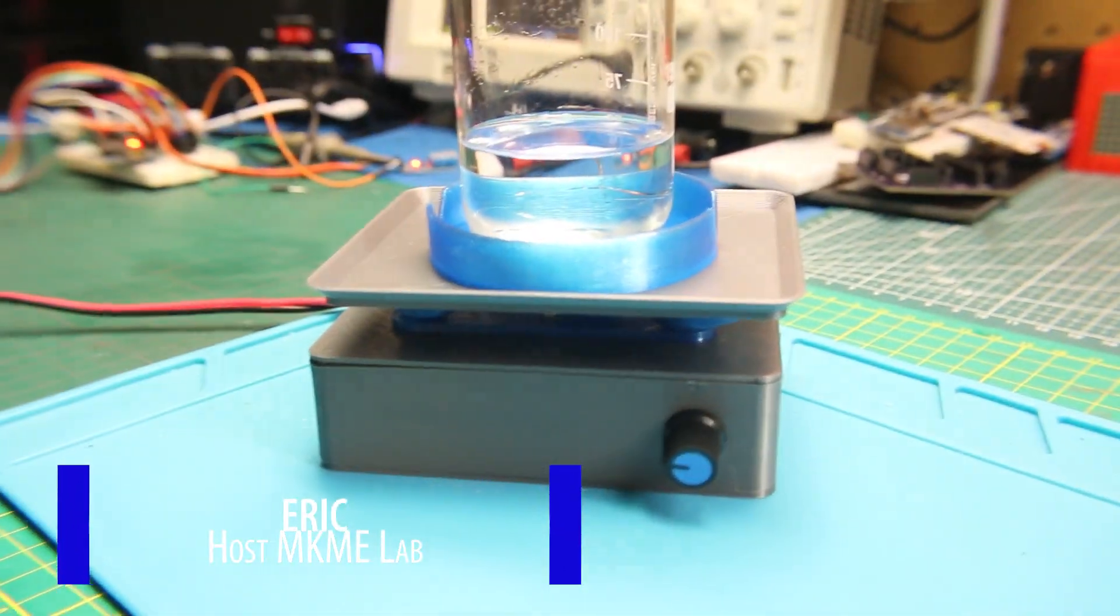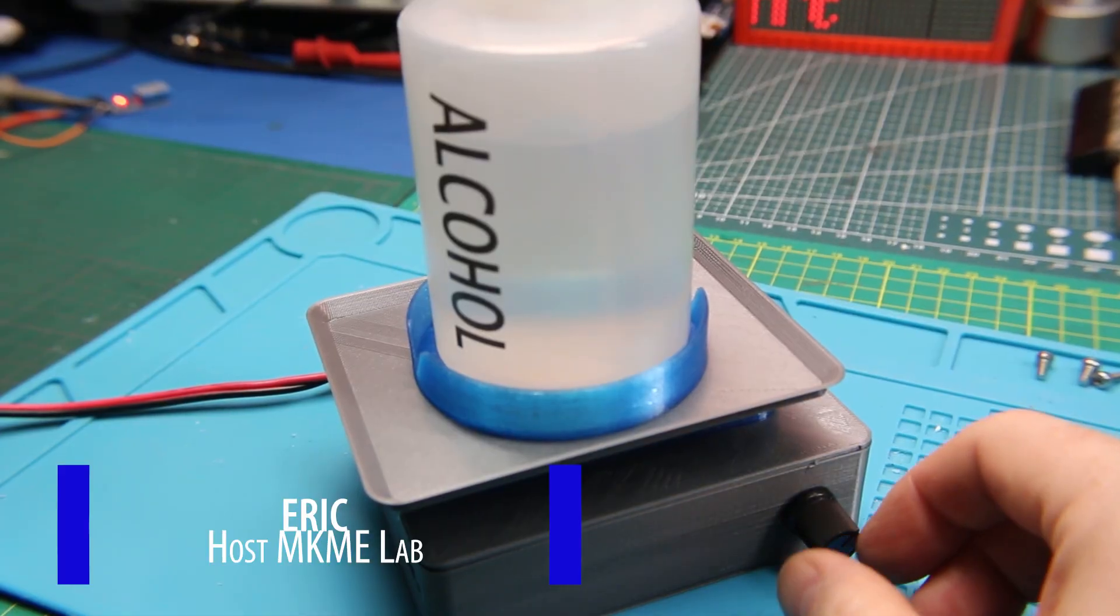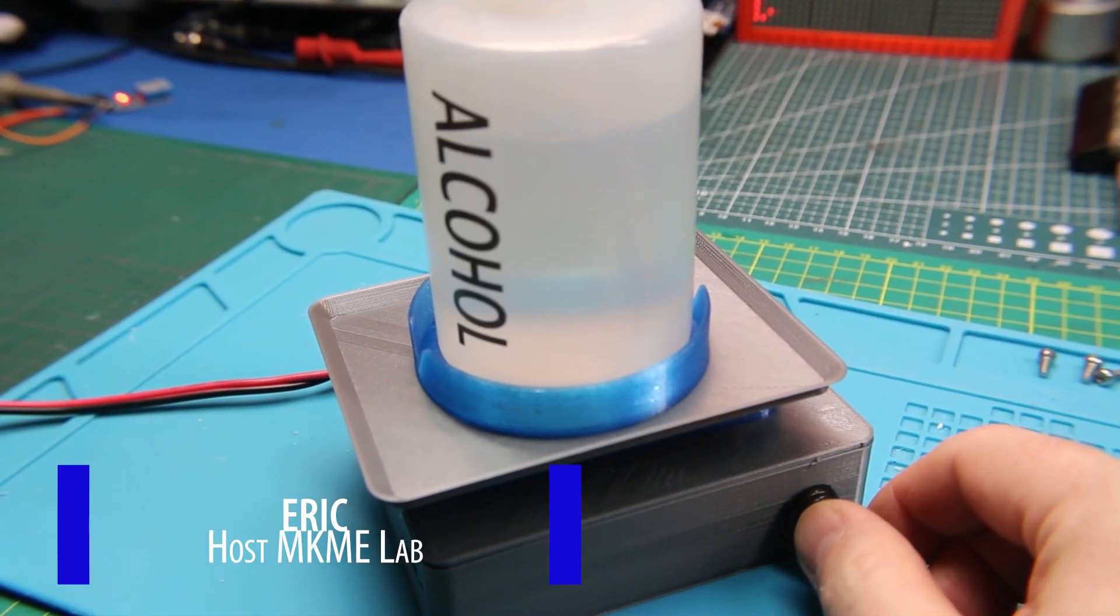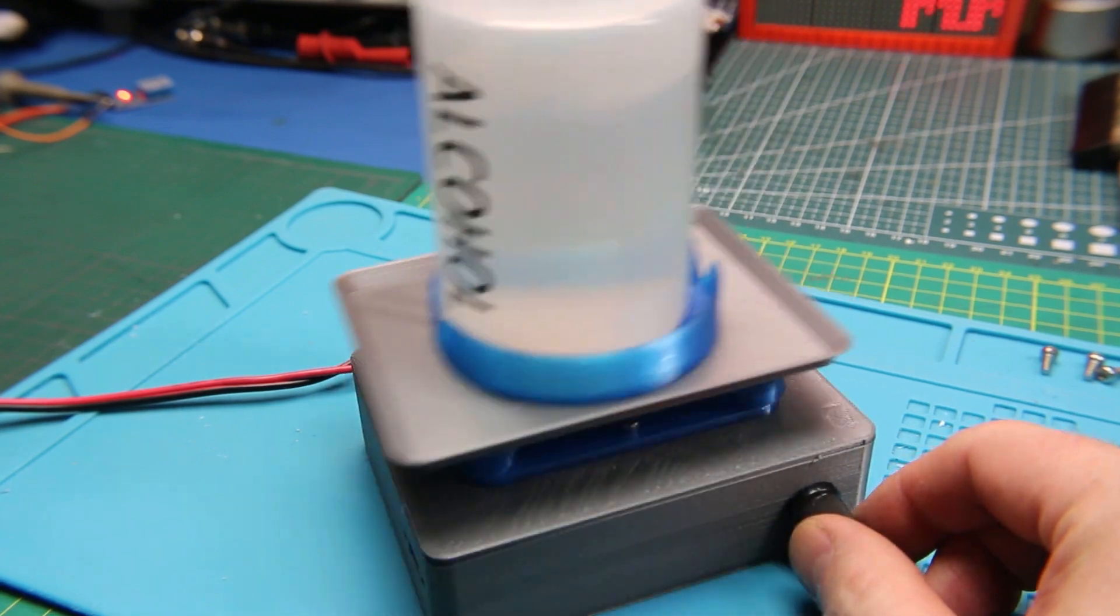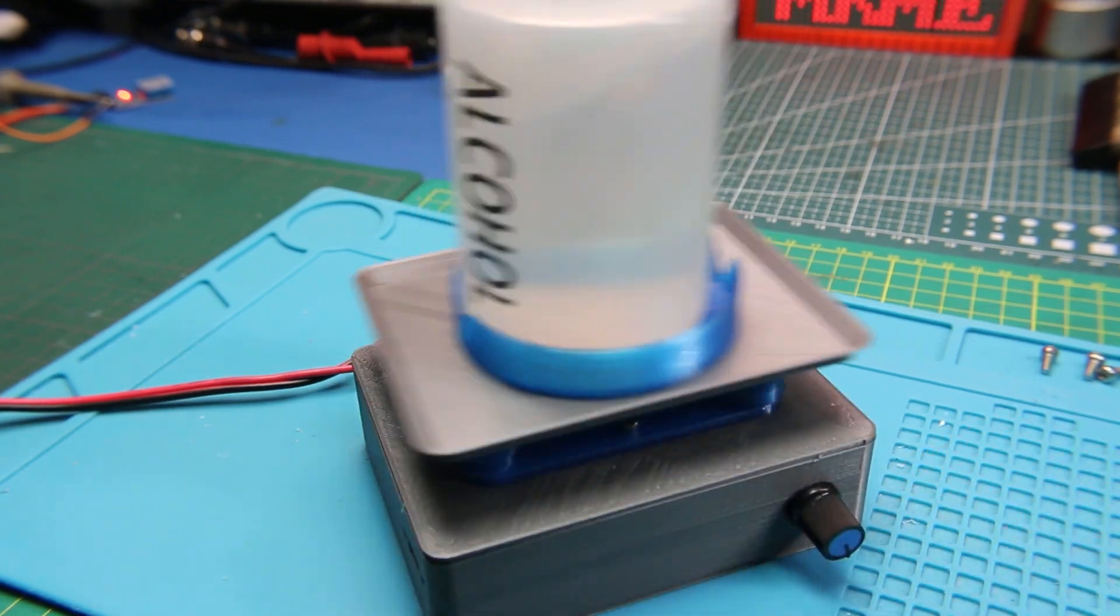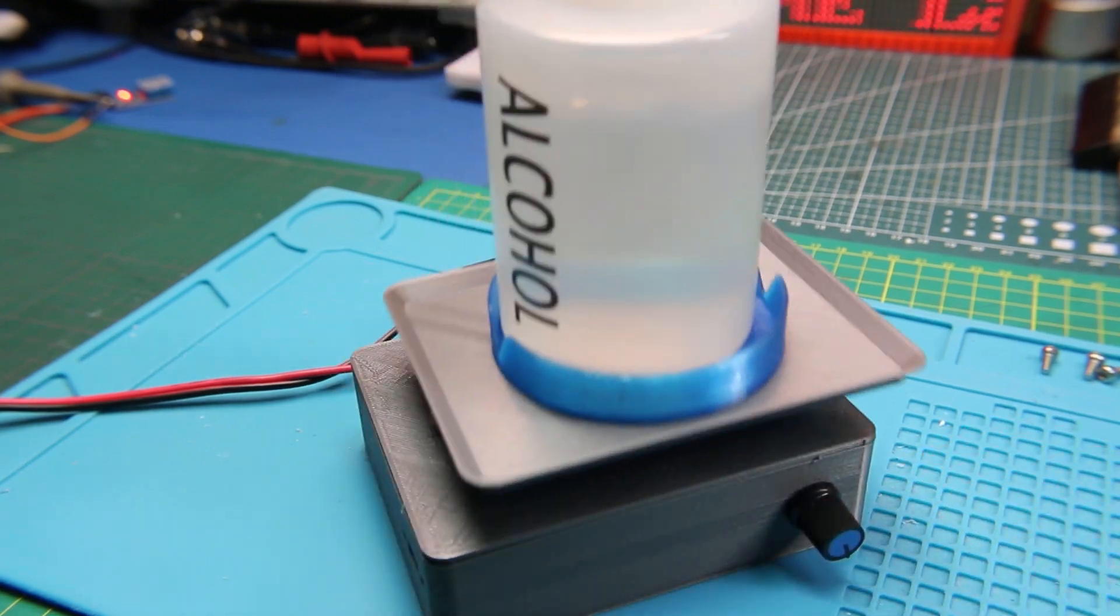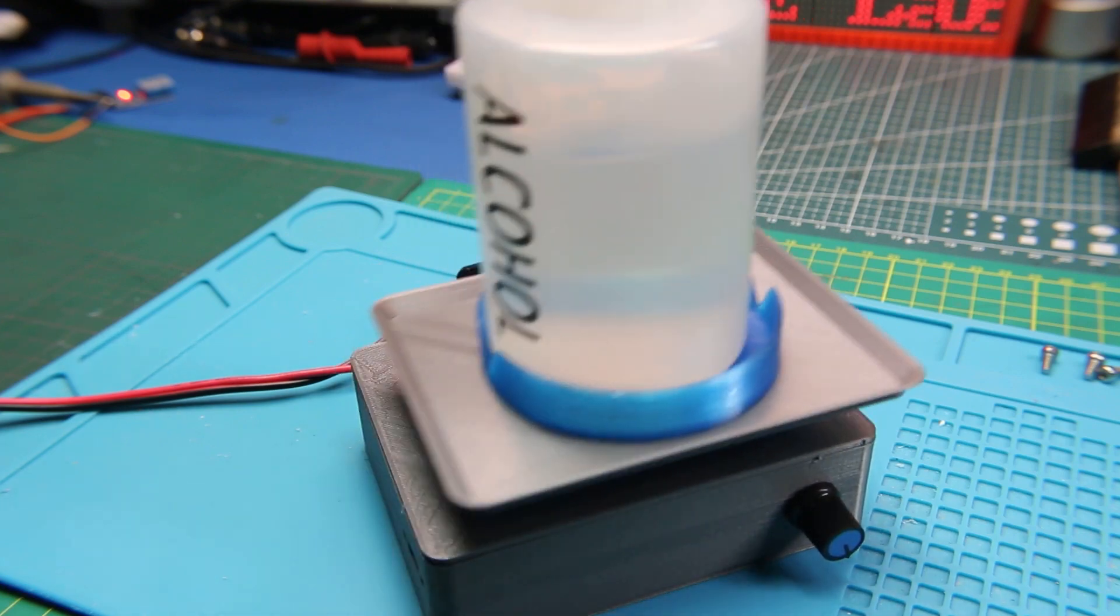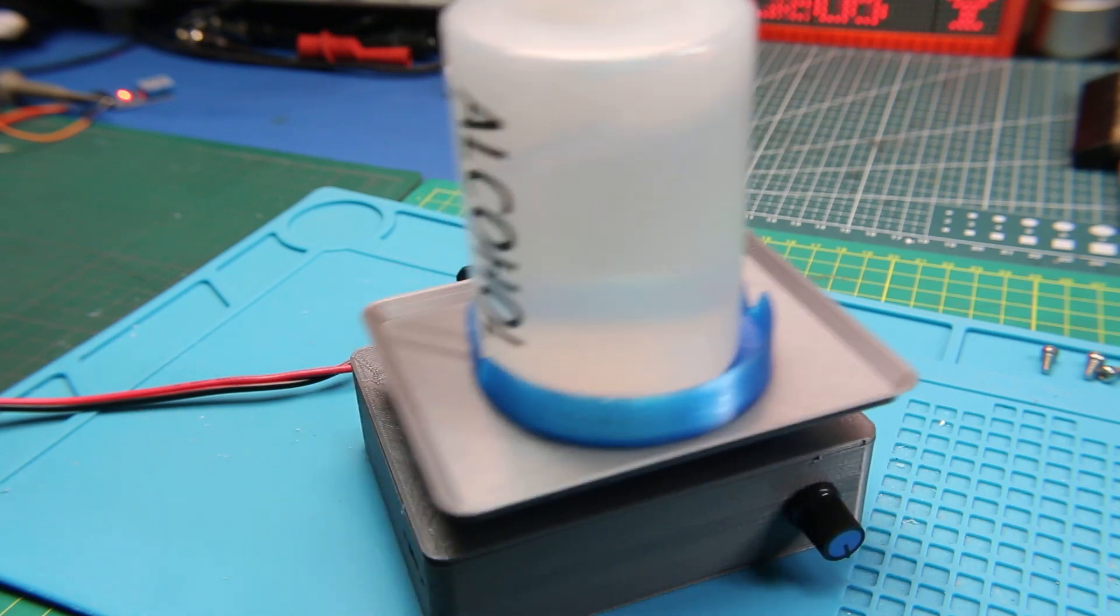People all around the world are creating their own laboratory equipment and supplies nowadays, and I thought I would like to make myself a shaker table so I can agitate some solutions in an upcoming project.